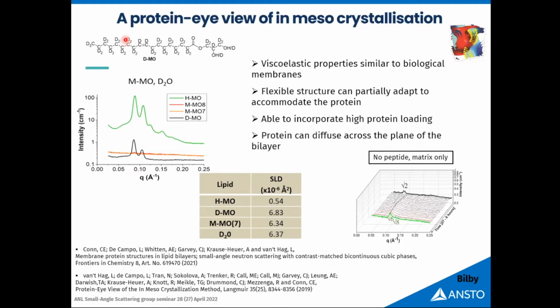So, this was working on the liquid crystal and the proteins, little proteins crystallizing inside the matrix. And here the complication was, remember we talked about contrast a little bit, we talked about substituting hydrogen by deuterium. Here the work was so precise because it was the matrix of the monoolein, the matrix for those peptides or proteins to crystallize inside. The interesting thing was how to build this matrix so it will not scatter. To be able to not scatter, you have to replace some hydrogen by deuterium.